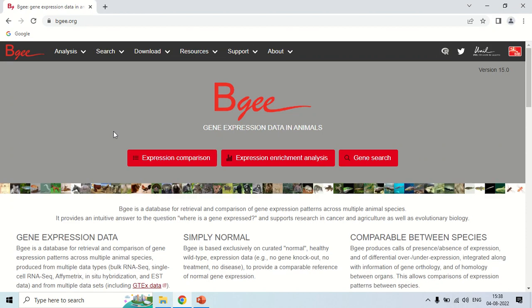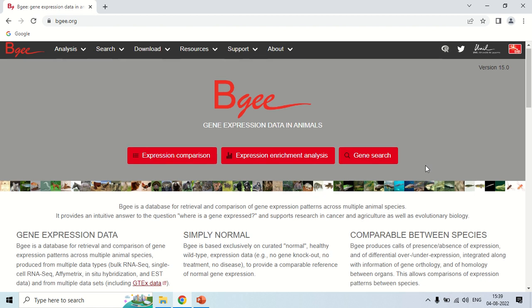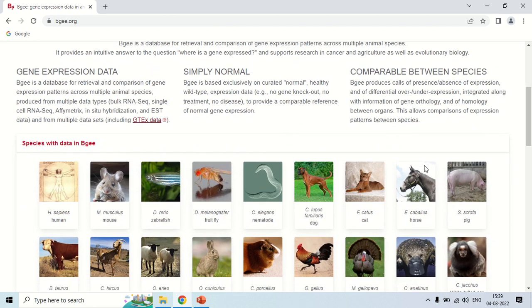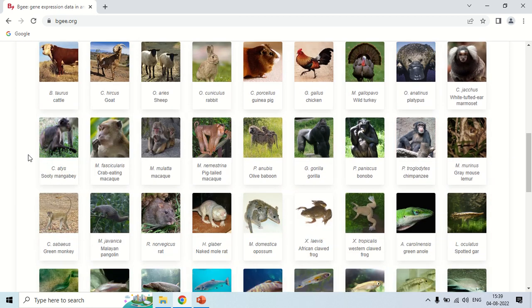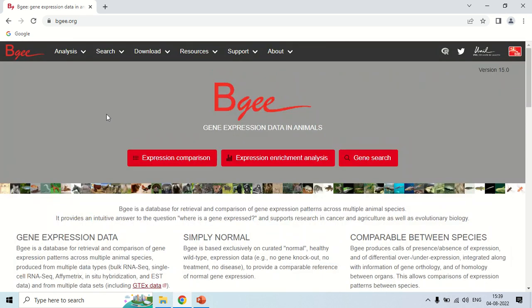As you click here, this is the home page of the BGE software. In order to search for the expression of a gene, there are three options: expression, comparison, and enrichment analysis. The enrichment analysis gives you the expression in different organisms. The gene search will search for the gene. If you scroll down, you can see how much data is available — these are the species whose data is available with this BGE software.